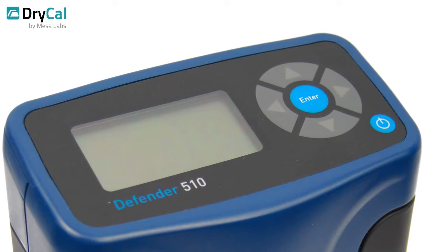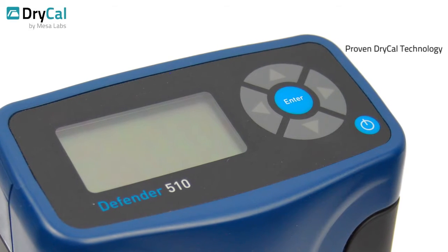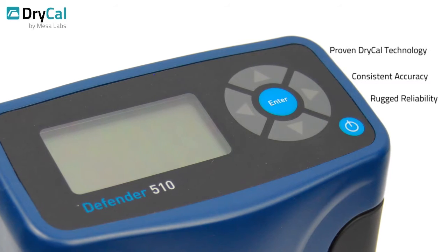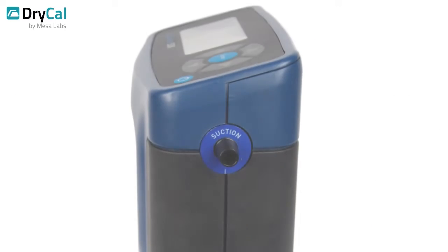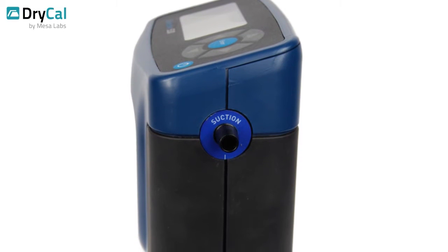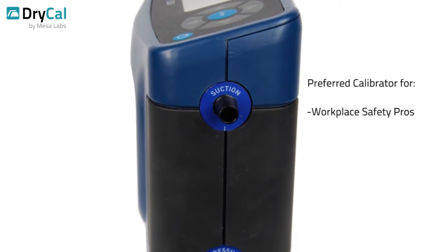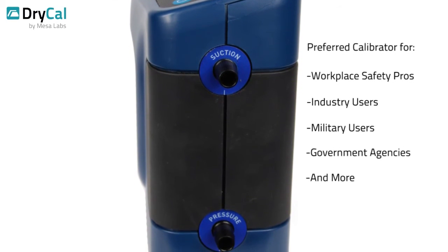Like all Mesa Labs flow calibration products, the Defender uses proven dry-cal technology to offer consistent accuracy, rugged reliability, and remarkable ease of operation. The Defender's consistent performance has made it the preferred calibrator for workplace safety pros and industry, military, numerous government agencies, and other users worldwide.